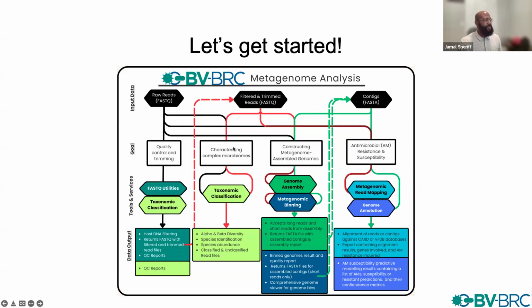We'll cover those things. We're going to construct metagenome assembled genomes, MAGs. We're going to use the genome assembly service to assemble contigs from our FASTQ files. We'll then take that FASTA file of contigs and upload it into the metagenomic binning service, which will cluster our contigs into genome bins and create our metagenome assembled genomes. All right.